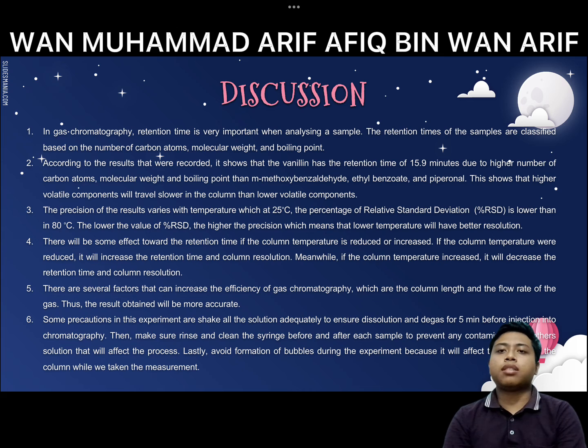Some precautions in this experiment are to shake the solution adequately to ensure dissolution and degas for 5 minutes before injection into the chromatography. Then, make sure to rinse and clean the syringe before and after each sample to prevent any contaminants and other solutions that will affect the process. Lastly, avoid formation of bubbles during the experiment because it will affect the reading in the column while we take the measurement.